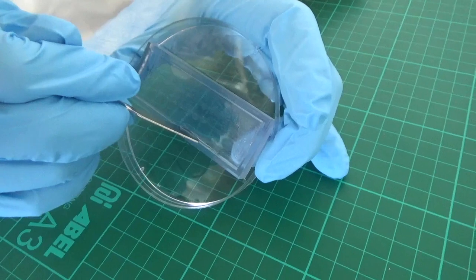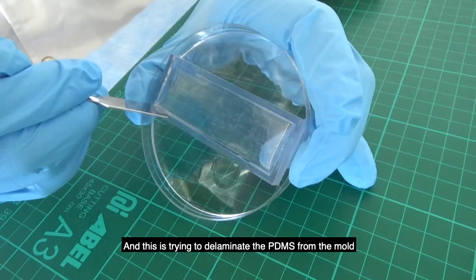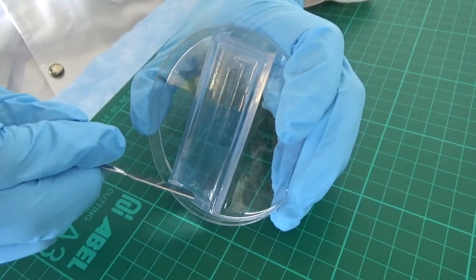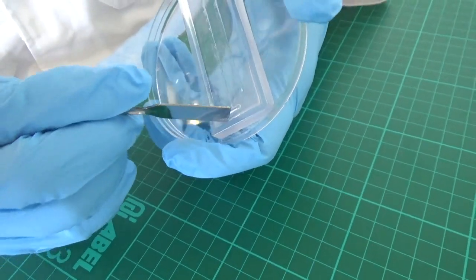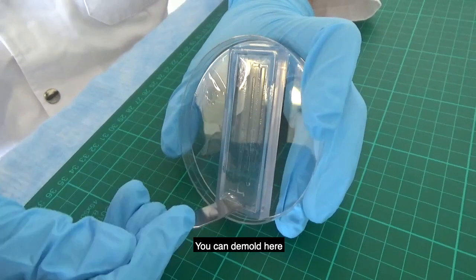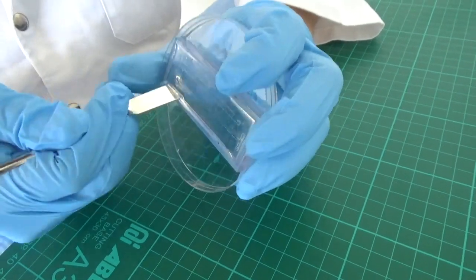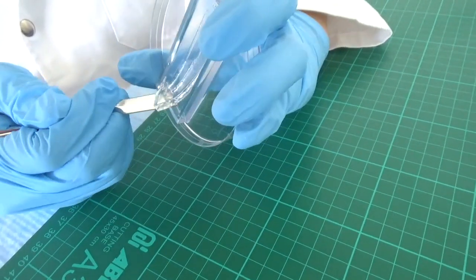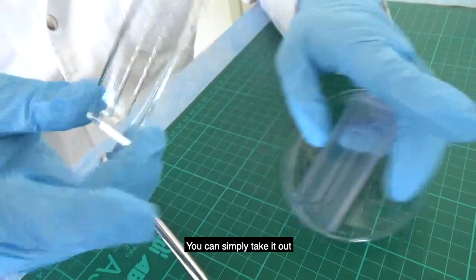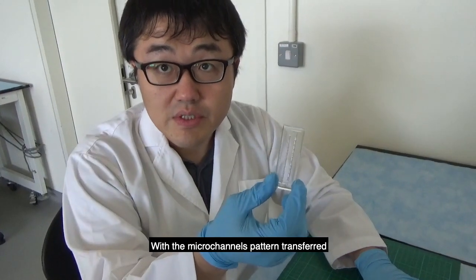Slide the spatula all the way around to delaminate the PDMS from the mold — you don't have to cut anything. Once you've gone all the way around, you can take it out and demold. This is the PDMS with the microchannel patterns transferred.